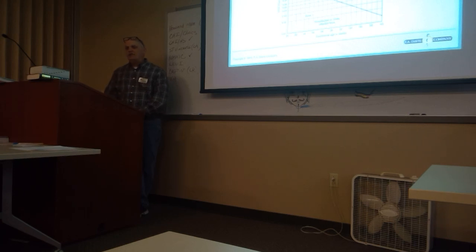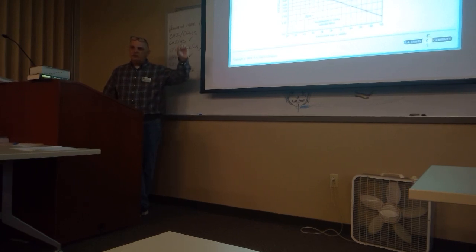So here's that Liley graph that I was talking to you about. You remember that example that I told you about? For example, at 450 nanometers, if the absorbance reading should be at 0.300, but you get 0.500, you agree that would be a difference of 0.2, right? So if we looked on this graph, look where 0.2 falls. It doesn't matter what the gestational age is. If it's a difference of 0.2 at any gestational age, that falls in zone 3. Zone 3 is not good, right?